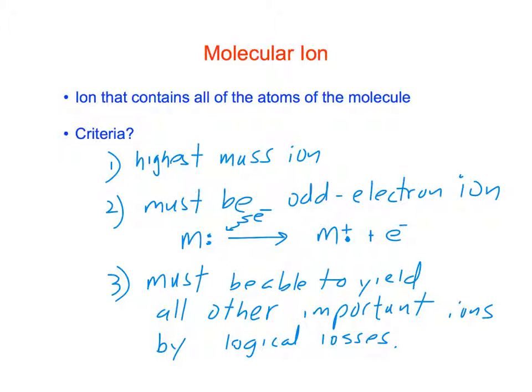Okay, what that means is that fragmentation should follow reaction mechanisms just like any other reactions we talk about. The challenge here is that we really have very high energy ions, and so they can do a lot of things beyond what we're going to talk about. But hopefully we can focus on what we would call the important ions.